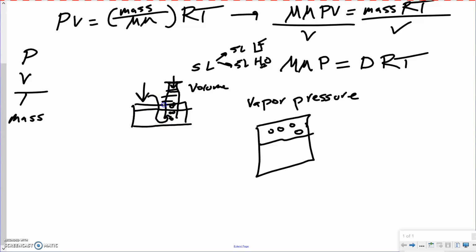And again, this is elastic because our water levels can change in both areas based off the pressure. So if I was to push down here and increase pressure outside, it would shoot the water up in here, therefore increasing the pressure in here as well. If I was to create more gas, it would push the water level down, again balancing our 2 pressures. So either way. Now, the pressure that's important here is equal to our atmospheric pressure, which will be dependent on today's weather, more or less, because remember, as storms or as cold fronts or high fronts or anything like that move in, it will affect our atmospheric pressure. So you'll need to get this from the Weather Channel, or Mr. Christie will provide it for you on the board. Either way, you will have to get your atmospheric pressure.